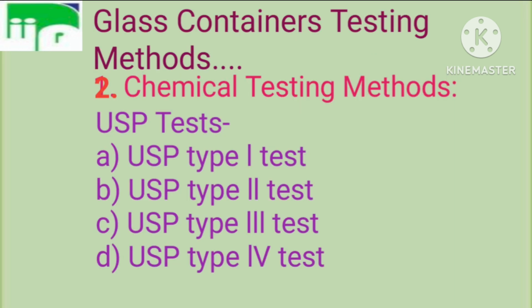Now coming to chemical testing methods. We are talking about USP tests. So it is basically a four type test we are going to perform.